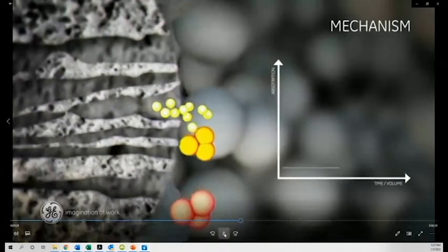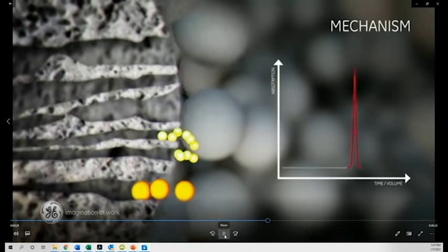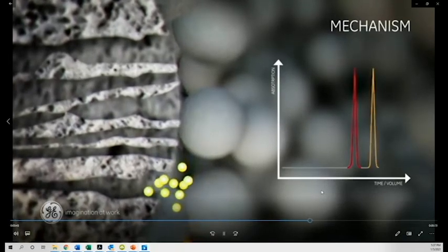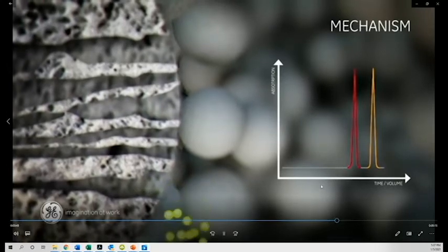Can penetrate the pores to varying degrees based on their size. Access to the pores is limited by steric hindrance. If a molecule is smaller than the smallest of the pores in the gel, it will be able to enter the total pore volume.